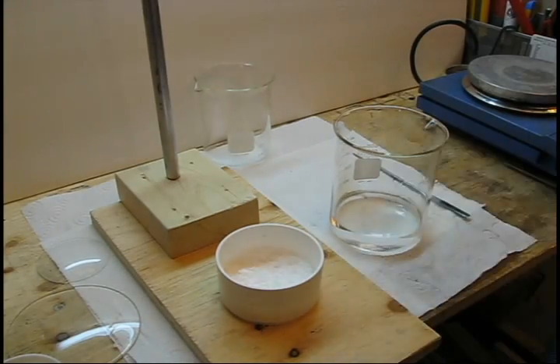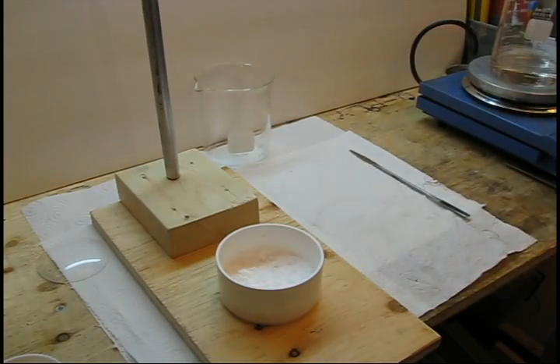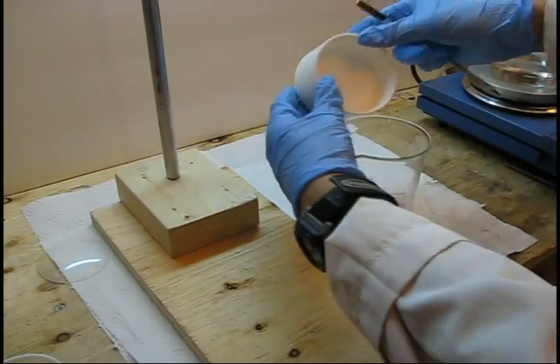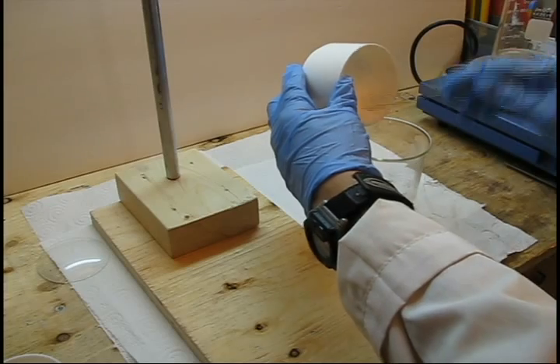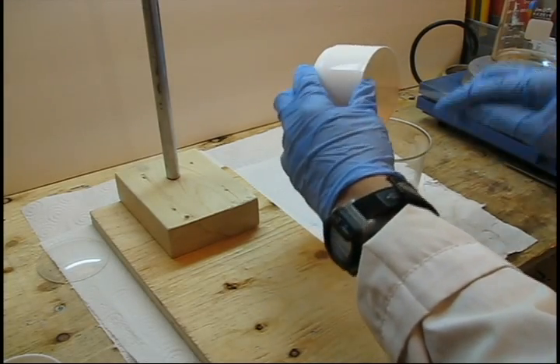To purify this powder, we will recrystallize the acetylsalicylic acid using isopropanol. Transfer the powder to a beaker and begin heating up approximately 200 to 300 milliliters of isopropyl alcohol in another beaker.